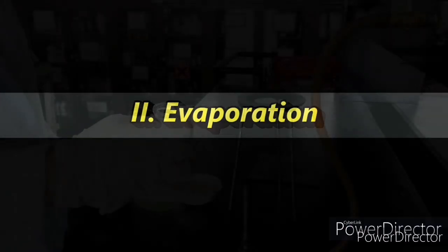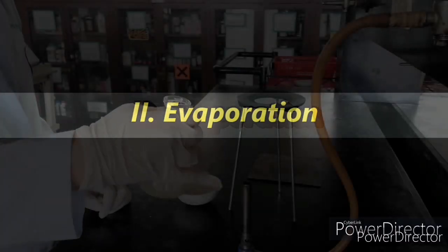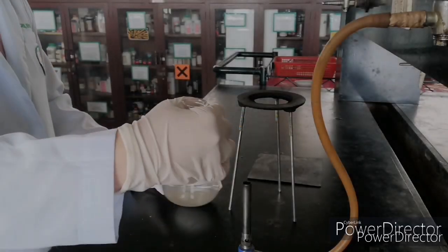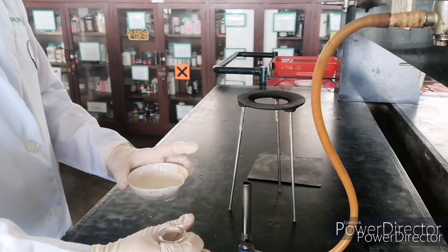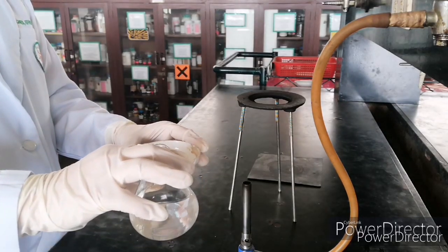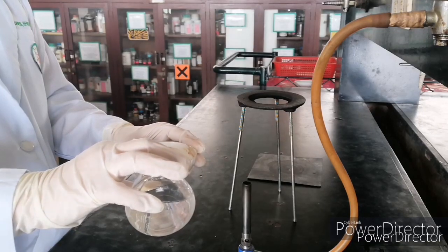Procedure 2. Evaporation. We will be using the filtrate that we have from your filtration setup and use it for our evaporation experiment.